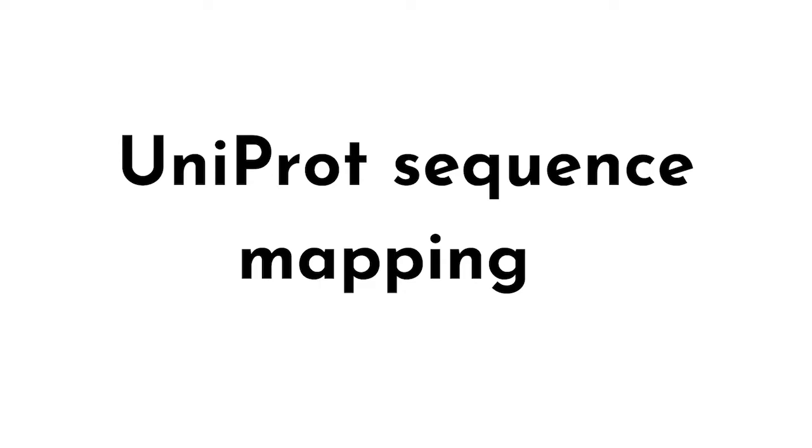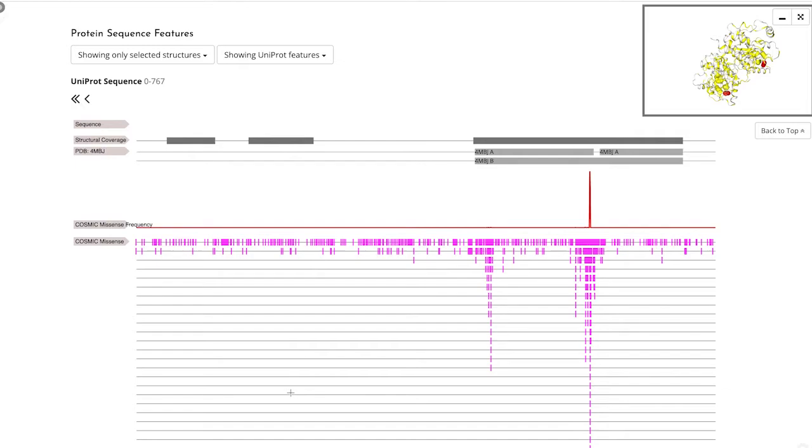The last feature is the UniProt sequence mapping and consequences of mutations. As discussed earlier, we map each gene to a protein sequence and align them, as you can see here. Underneath, you can look at specific mutations.